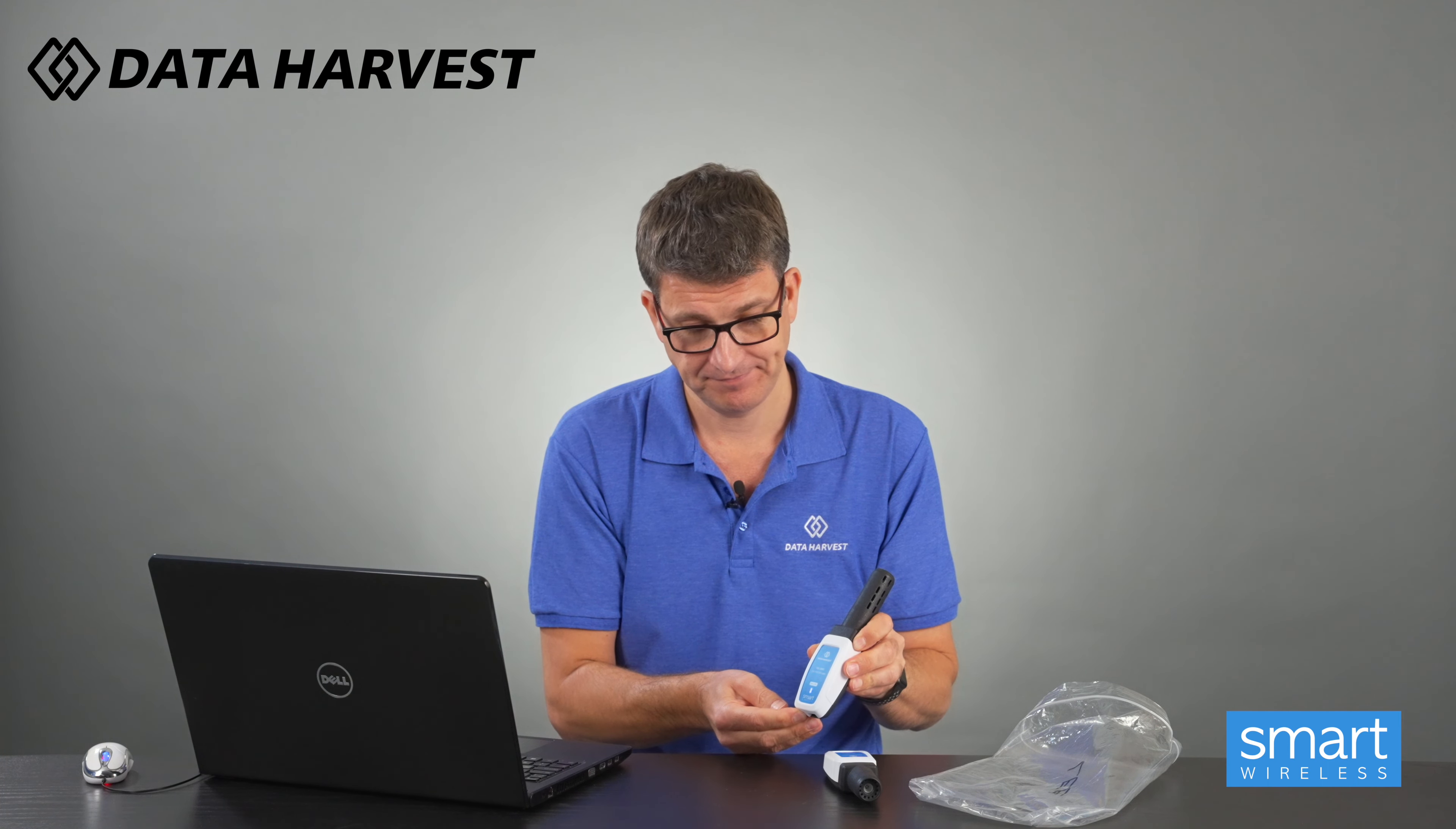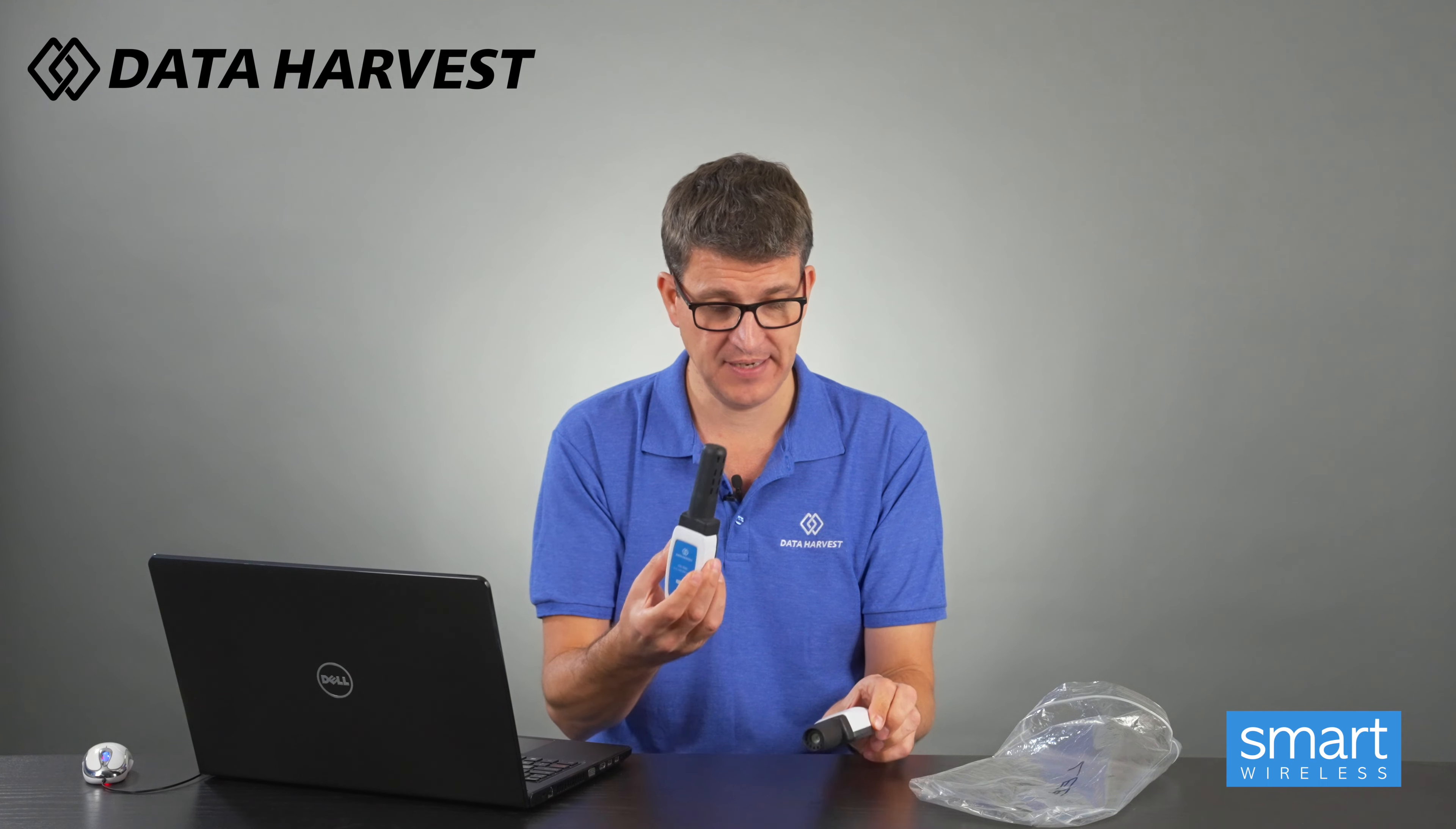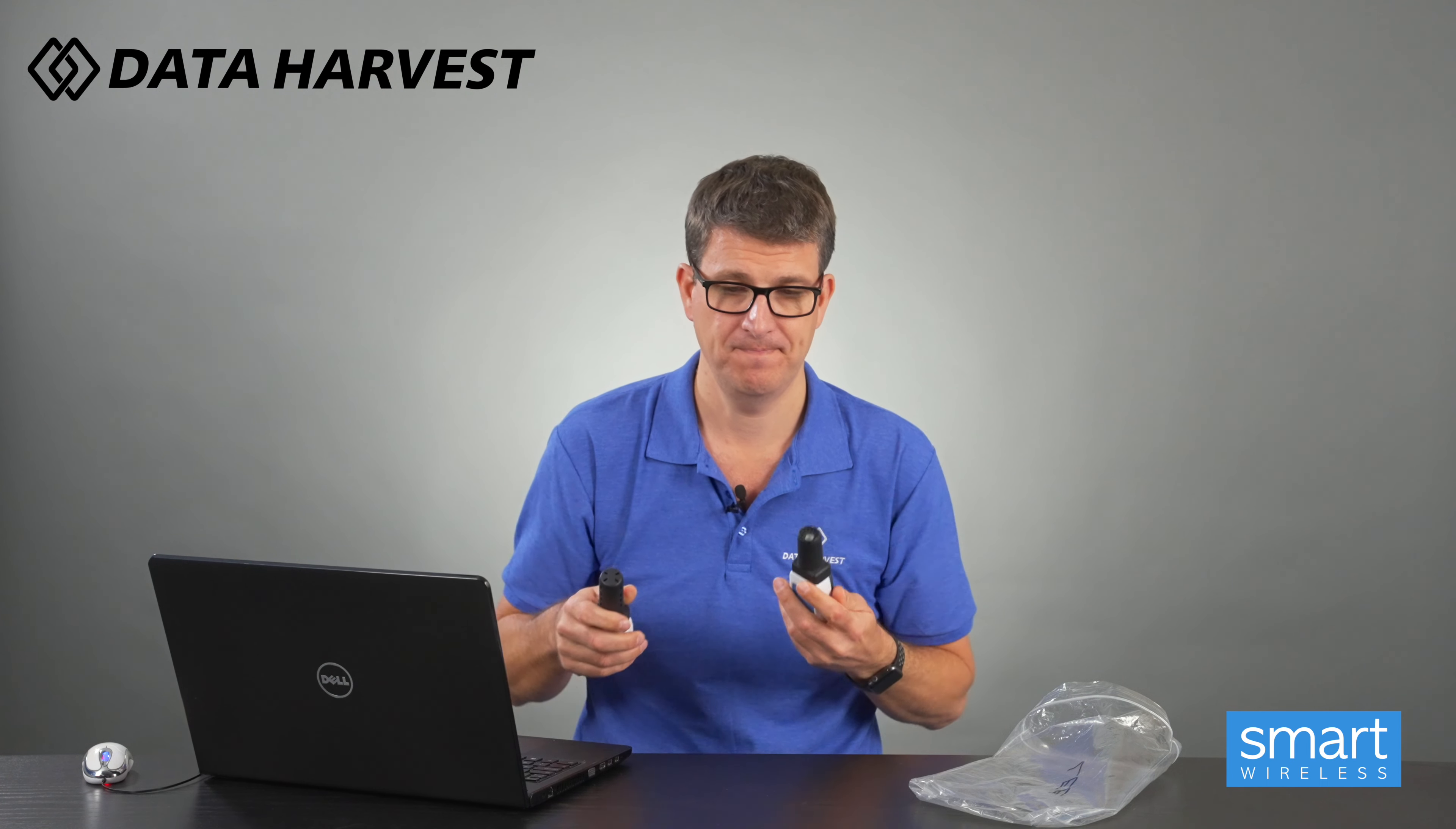The same with the CO2 sensor here. So now that should be flashing, that one's flashing, so there you go, so we're now both flashing on there.